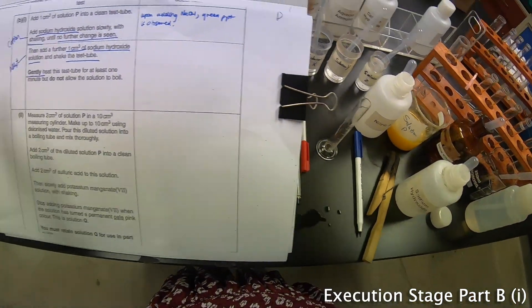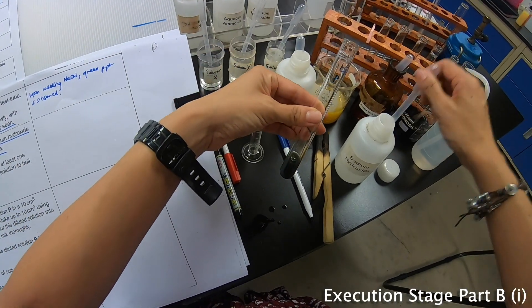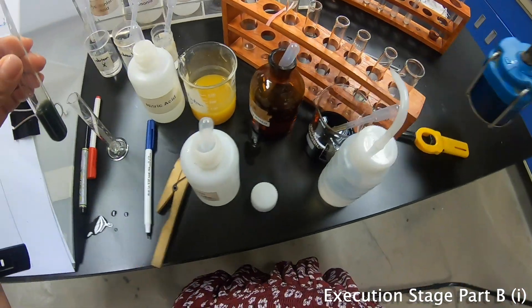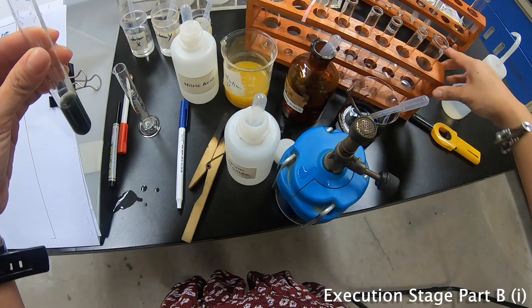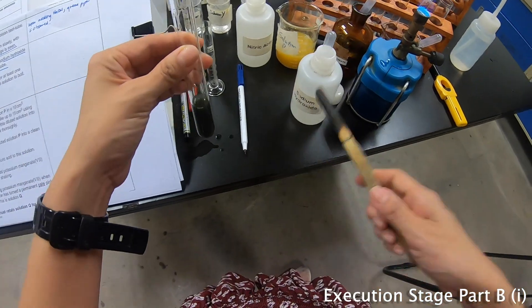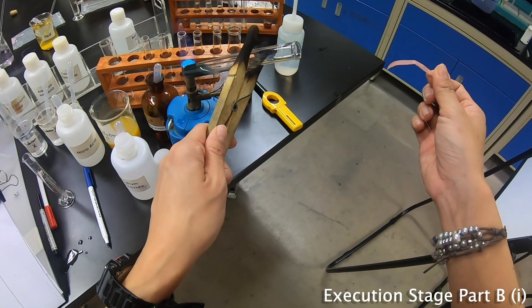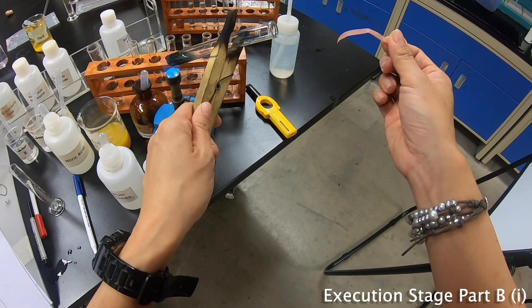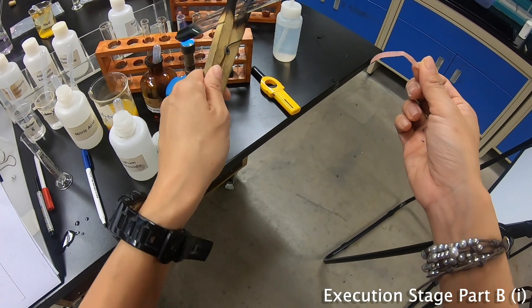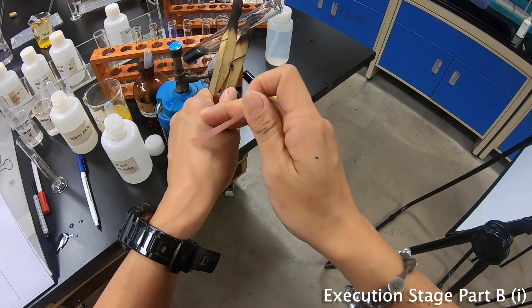The next part is to heat this and add another further 1 cm³ of sodium hydroxide, so I'm going to add another 1 cm³ now. Then I'm going to light up my Bunsen burner and prepare my litmus paper. As you hold the test tube, you will feel it vibrating — be careful. Do not do both at the same time.